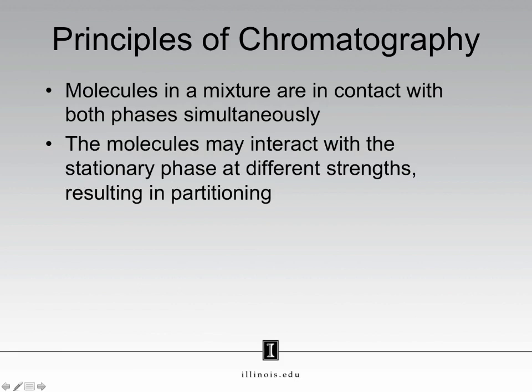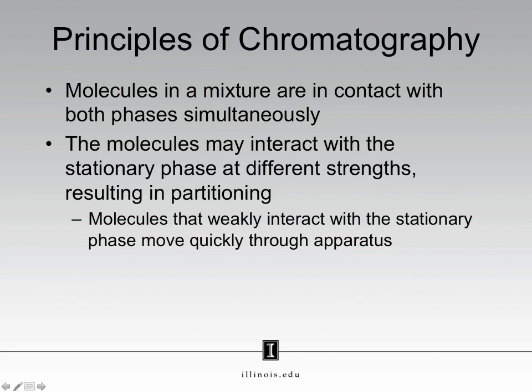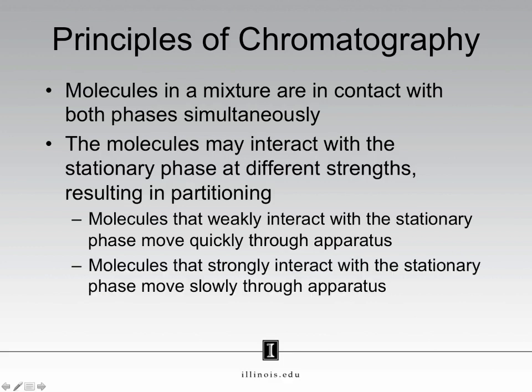This results in partitioning. Molecules that weakly interact with the stationary phase will not stick to the stationary phase very much. As a result, they will spend a great deal of time in the mobile phase and will move quickly through the apparatus. In contrast, molecules that have a strong interaction with the stationary phase will stick well to the stationary phase and will not spend much time in the mobile phase. Therefore, they will move slowly through the apparatus.